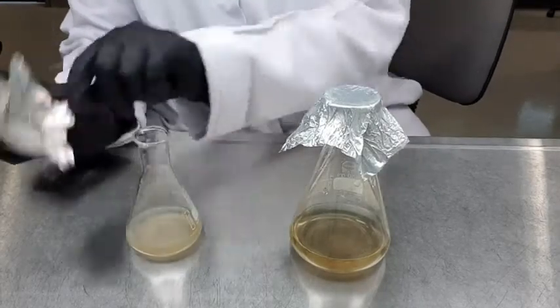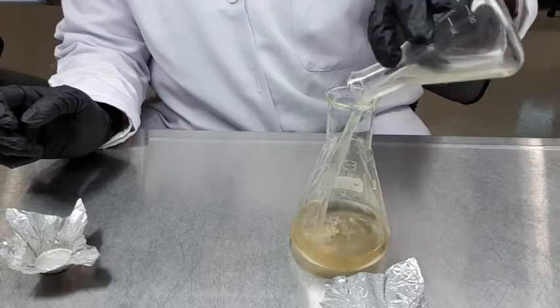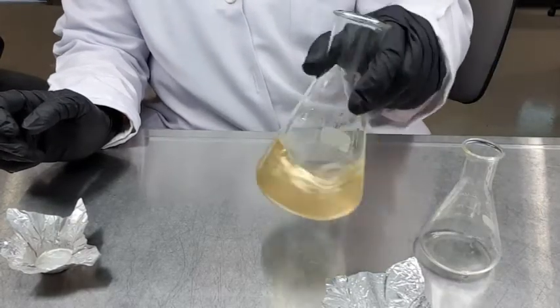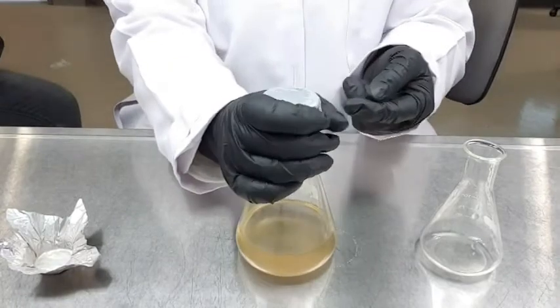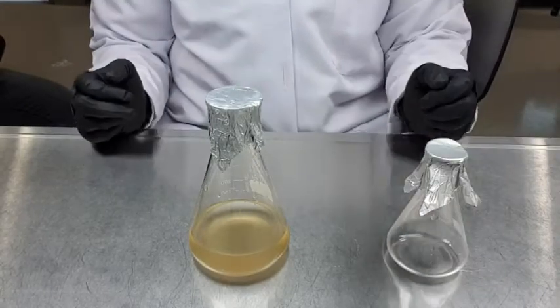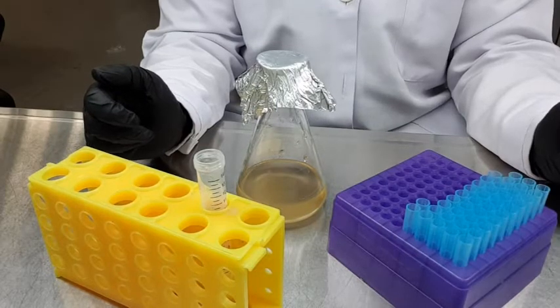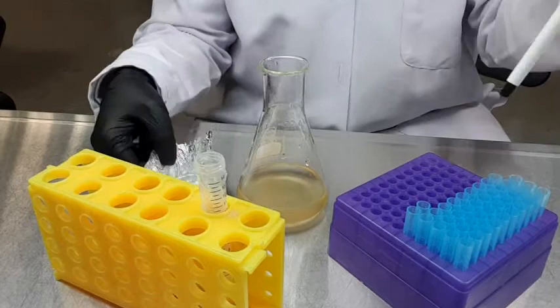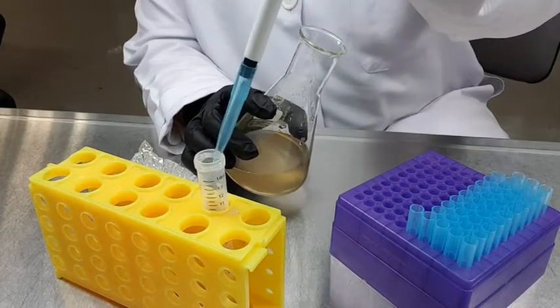When your inoculum is ready, it's time to start the fermentation. Transfer the inoculum into the glucose fermentation media. Inoculum comprises 10% of the fermentation volume — if your fermentation volume is 100 ml, you will need to add 10 ml of inoculum. You need to make an immediate sampling for your initial reading, which is zero hour. Take up 5 ml of the sample and place it into a sterilized tube.